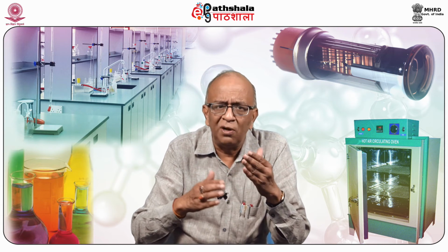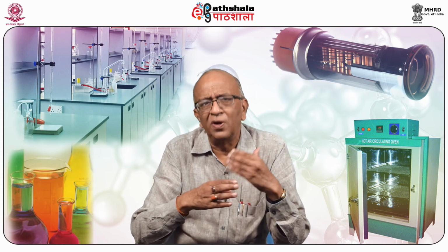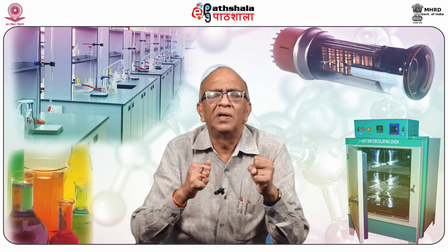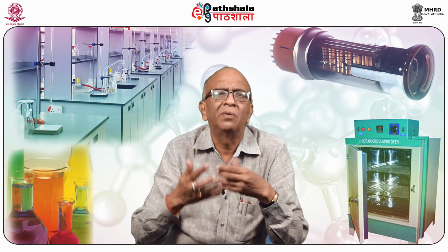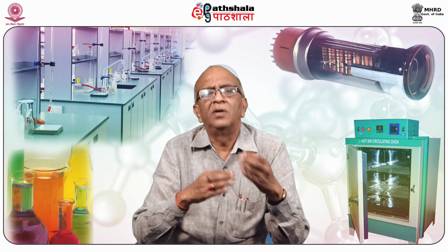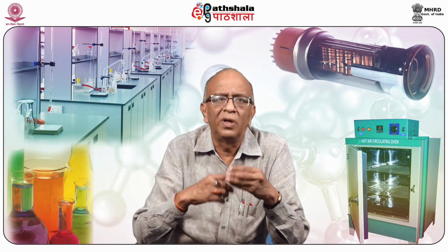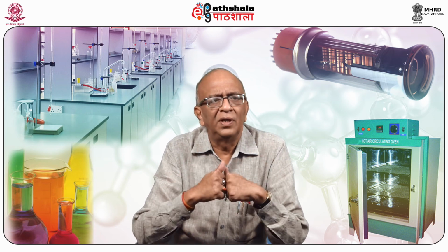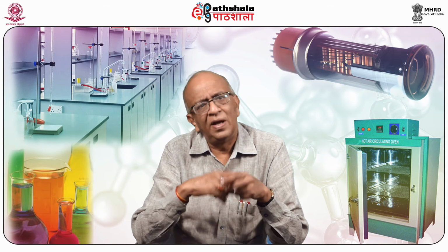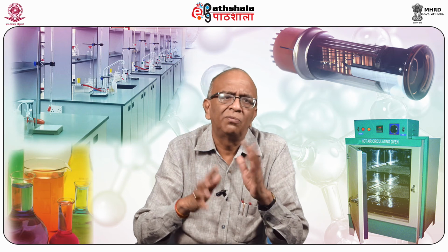Earlier, by conventional methods, it used to be very difficult and time-consuming, using classical techniques. But by paper chromatography, it has become very simple. We take a piece of paper, usually chromatographic Whatman paper or any type of paper, put it in a jar, and develop it. If on development we find more than one spot, then we can safely say that some impurities are present. Those impurities can be removed, then we run the paper chromatogram again, and we may find out whether it is the purest possible compound.